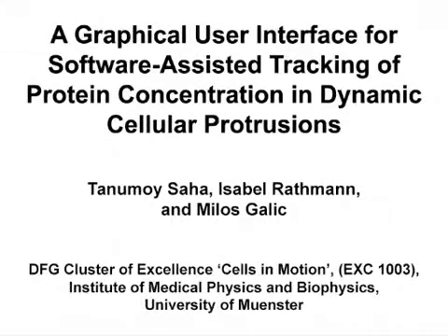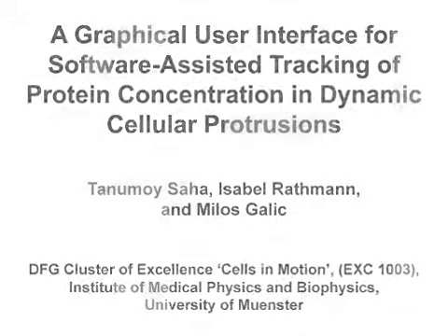The overall goal of this image analysis software is the parallel analysis of protrusion dynamics and relative protein concentration along the entire filopodial length. This method can really help us understand key questions in cell biology, especially the individual proteins involved in extension and retraction of filopodia. The main advantage of the technique is that the adaptive shape tracking algorithm provided allows quantitative assessment of protrusion dynamics and spatially resolved protein localization.